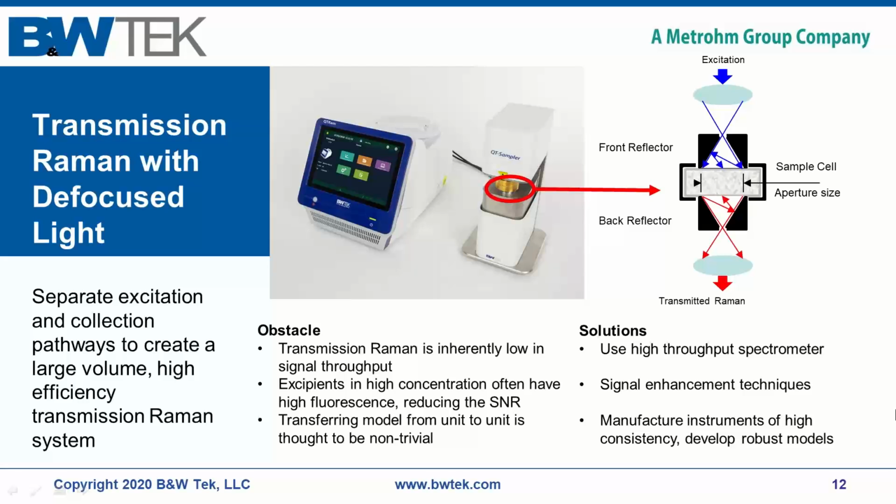So it's important, first of all, that the reference values that one gets from HPLC are highly accurate. Because if they are not, then that will introduce error into a Raman method. But one expects that with good and accurate reference values, your Raman spectroscopy method can match that type of accuracy.